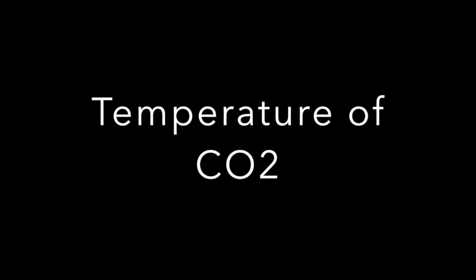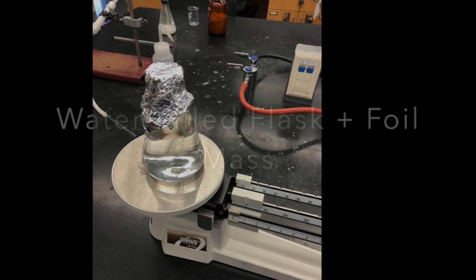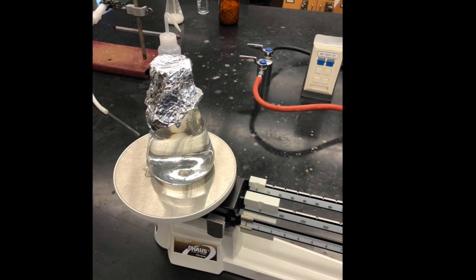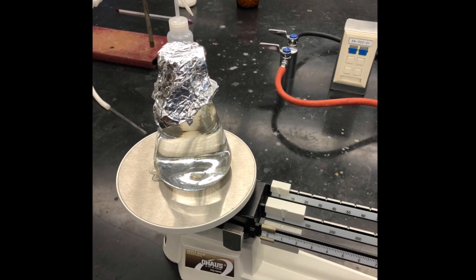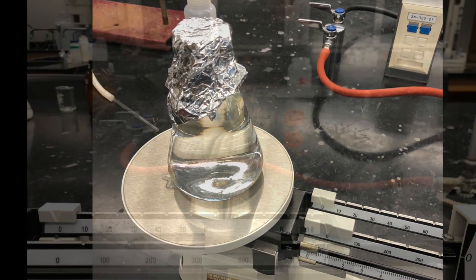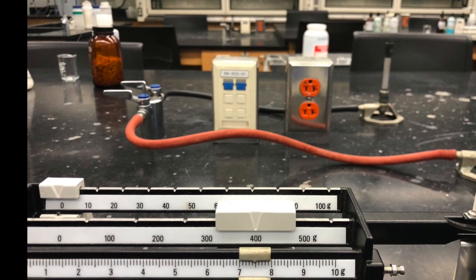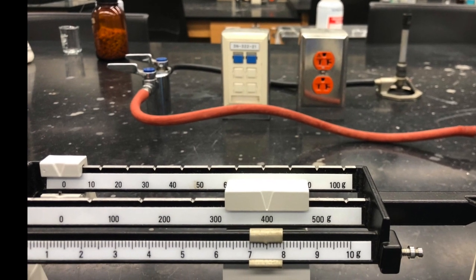Since this is the final flask of carbon dioxide, we will need to take its temperature before the CO2 escapes. Now we will need to find the volume of the flask by filling it with water and taking its mass. This is the mass of the filled flask with water on our triple beam balance, because it's too heavy for the electronic balances.